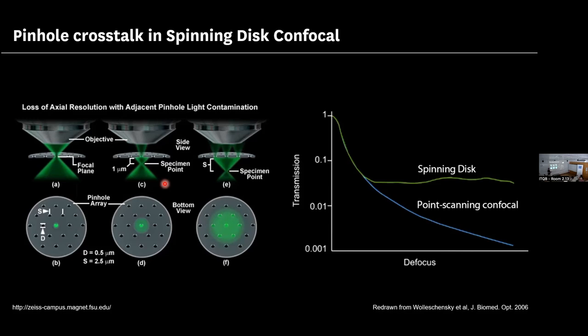Yes. And we don't lose information with this lower sample? You might lose information. Yes, the point scanning confocal will give you a thinner slice and a higher signal to noise ratio at the expense of speed. So yes, for a very, very thick sample, a point scanning confocal will give you a higher resolution, more information than a spinning disk. Yes. I hope I'm getting this right.